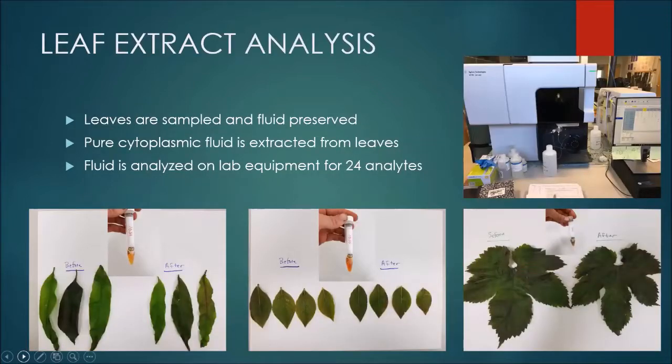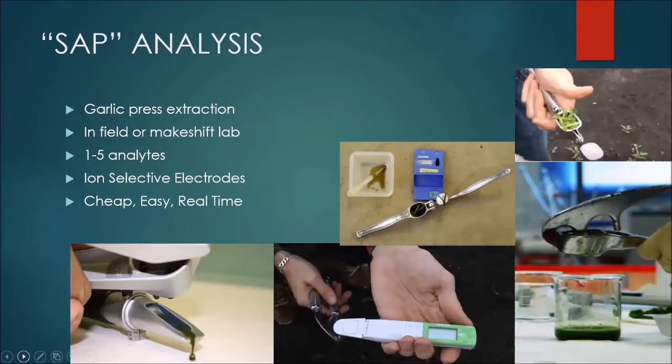And so in order to do this, we started looking at how do we access the depths inside the cells of the plant. Just comparing and contrasting briefly some of the, quote unquote, sap methods versus what we do in our lab: you look at the picture on the right here on this slide, and that's what a lot of other folks do when they refer to sap. They're crushing the leaves, they're pulverizing them, and then they're utilizing that juice.